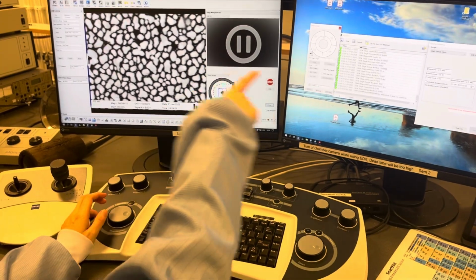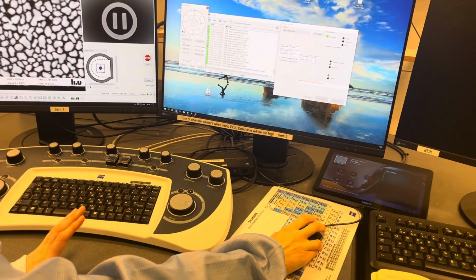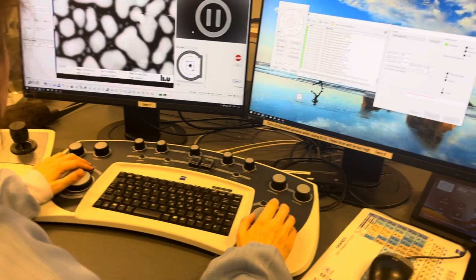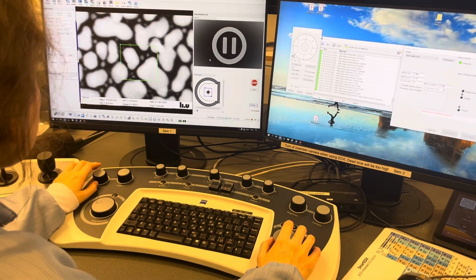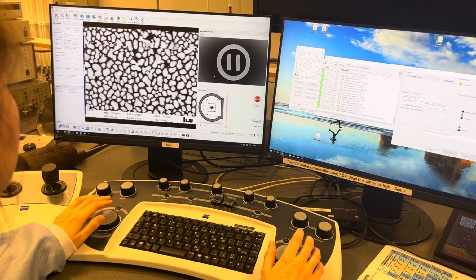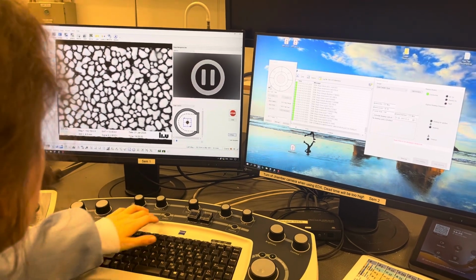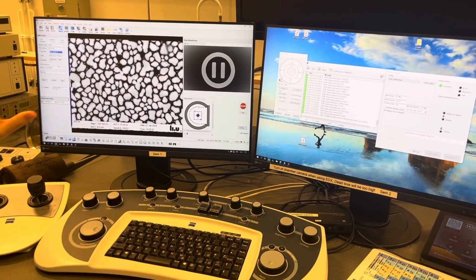So now when all this is activated, S1, S2, when all this on, we are in a compositional mode. Yeah. So now our contrast, and I think I need to do a bit of alignment. It's not super good, but anyway. So now we are in compositional mode. So you can see that the image looks quite flat comparing. Yeah.